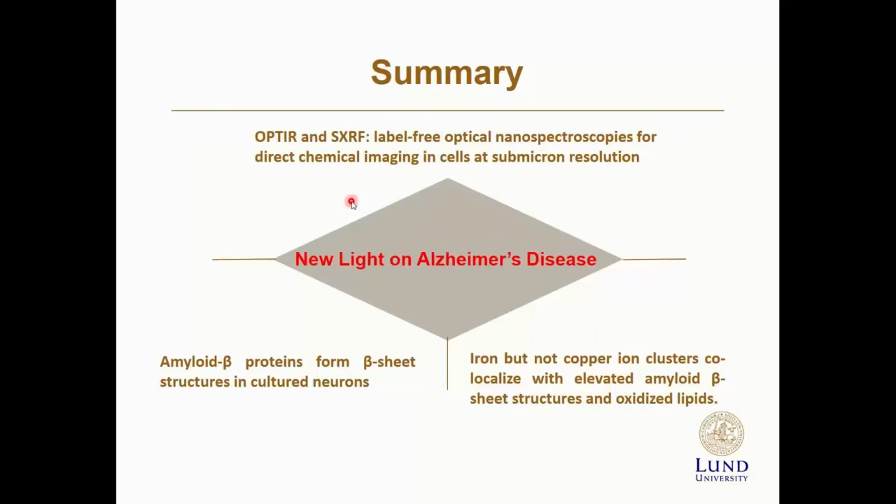This was very important to preserve all metals and to preserve all amyloid structures without altering them using procedures that are needed for labeling of amyloid structures, for example.